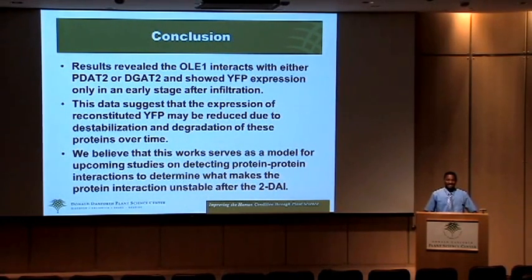How do you determine where you put half of the YFP? We use the N-terminal and the C-terminal of the YFP fragment, and those two combine together to create a yellow fluorescent protein. Where is it on your protein of interest? Is it on the N-terminal?